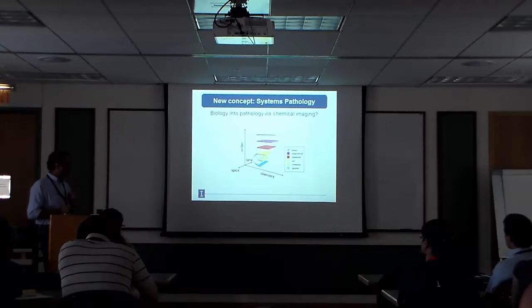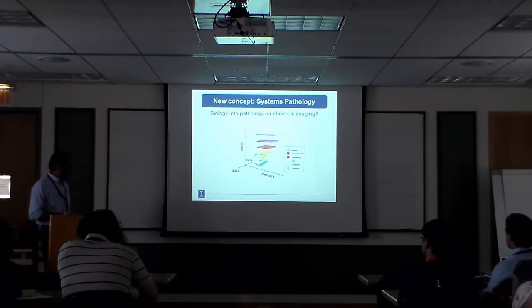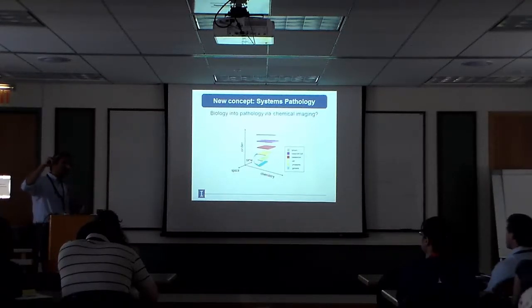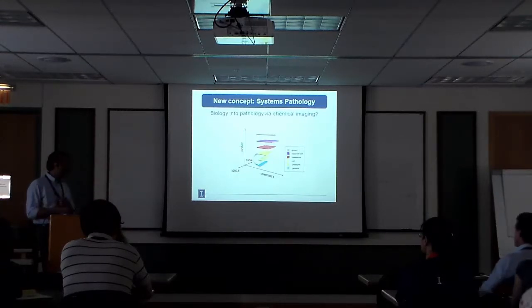And the whole idea behind all of this is really what you have to think about when you analyze tissues or look at cancer progression in particular, is that there's a chemical change, of course, but there's also space and time, right? These are two other variables in this. And there's also hierarchical order in organisms. So something happens locally, at the gene level, then it transfers hierarchy to a protein level, which then transfers hierarchy to the cellular level and so on. But even on the gene, something happens at different points in the genome, at different times on the same points in the genome. Different kinds of chemistries might happen on the same type. It could get inhibited, it could get activated, whatever, right?